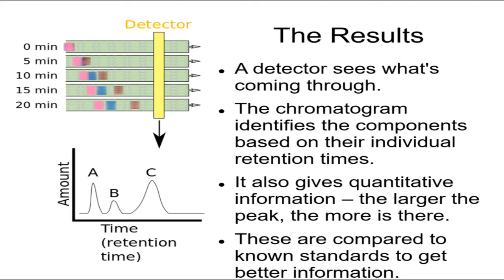Okay, so there's liquid chromatography. We use a liquid to flush it through. There's gas chromatography, which uses a gas to flow it through. But it's all the same idea. Some things cling to the column more; they hang back. Some things just slip right through; they go forward. They all cling differently. They all go through at different speeds. They're all detected at different times, and they give you this chromatogram.